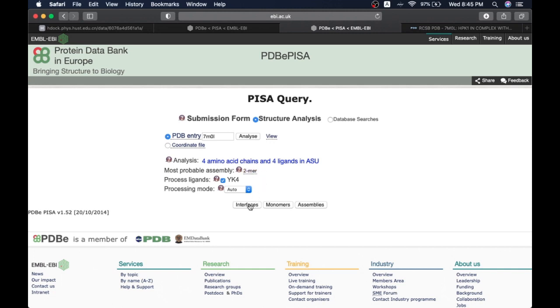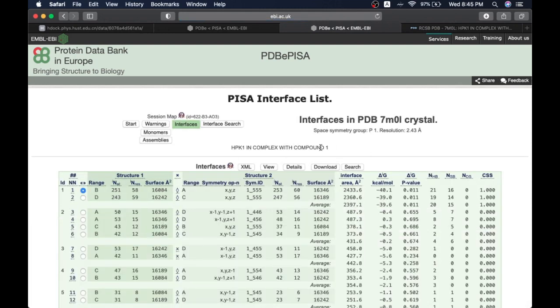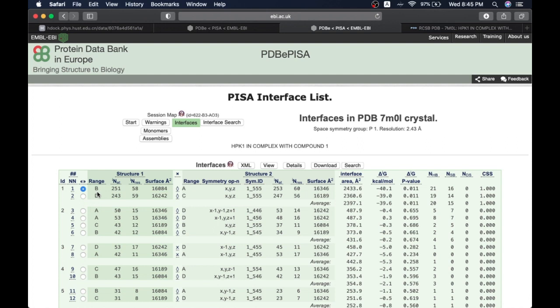This is the result page — the outcome of PISA's interface list. This protein has four chains: A, B, C, D. You can see the interactions found between the interfaces — the first ID indicates interaction between B and A chain, and D and C chain, along with other contacts in the macromolecular assembly. When you have a molecule with multiple chains, there might be contacts between the chains — here there are contacts between A, D, and C, B as well.